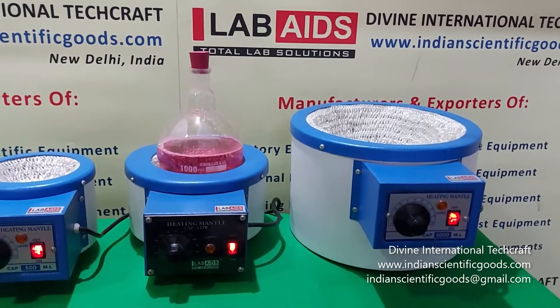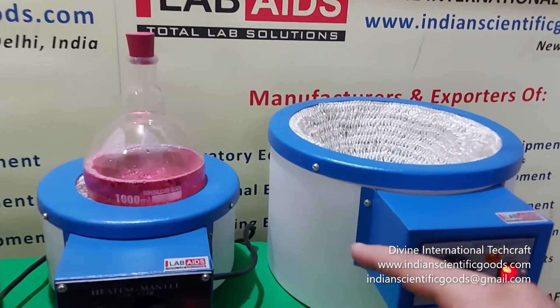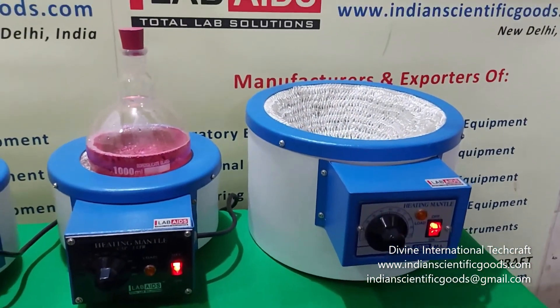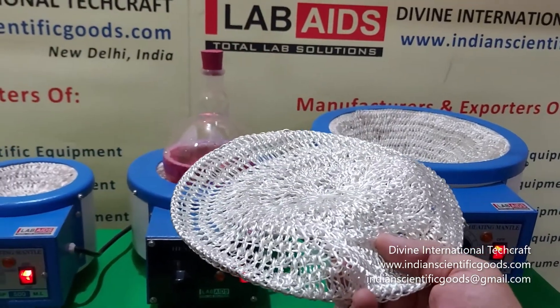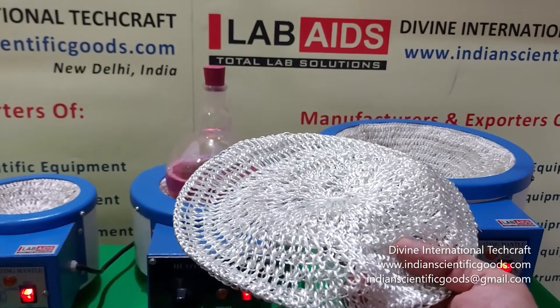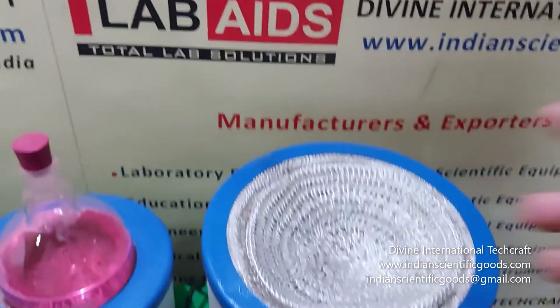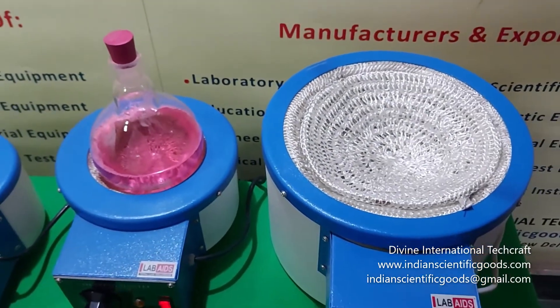The heating mantles consist of a single piece spun body made from non-rusting aluminium that is powder coated and stove enamel painted. An electrically heated basket or nest made of hand knitted jointless fiberglass yarn is fitted inside the aluminium body. This acts as a basket or nest for the round bottom flask.